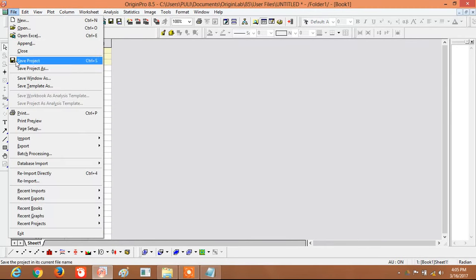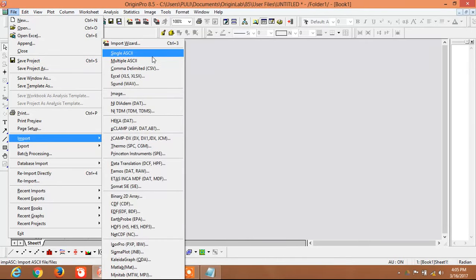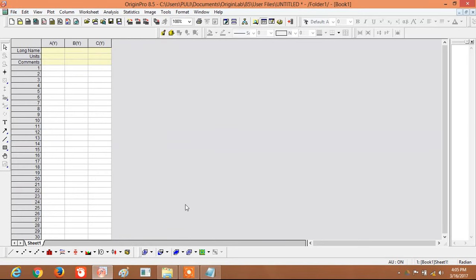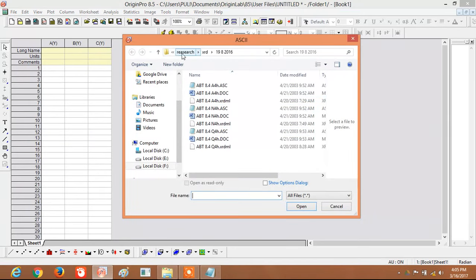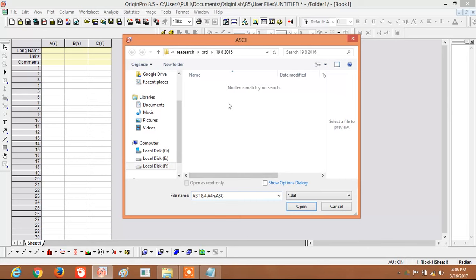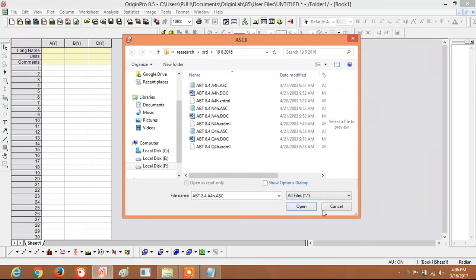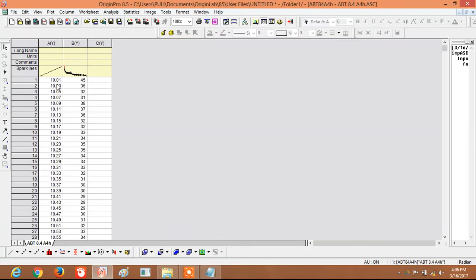Go to the File menu, click on Import, and select 'Single ASCII'. Now open your data file. Please make sure to select 'All Files' here — otherwise ASCII files will not appear because they won't show under data files only. Once you select All Files, the ASCII file will be visible. Click on the ASCII file and select Open. The data is automatically updated.